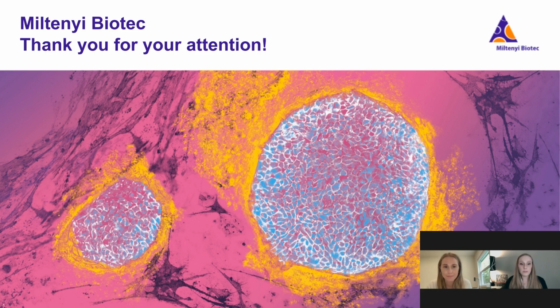Yeah, so the MACSima has a total of 8 slots in the sample and reagent chamber area that I alluded to earlier. It can hold up to 8 slides at a time. Typically, though, we run about 3 to 4 samples at a time based on our antibody panels, right? We're doing a lot of these so that the sample doesn't sit unprocessed for an excessive amount of time.